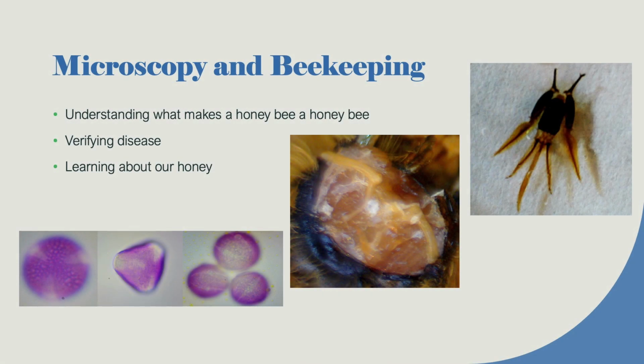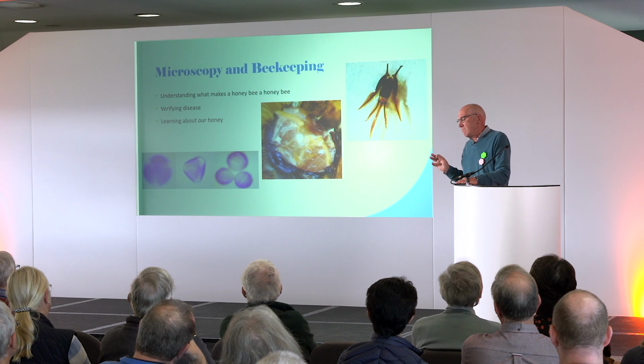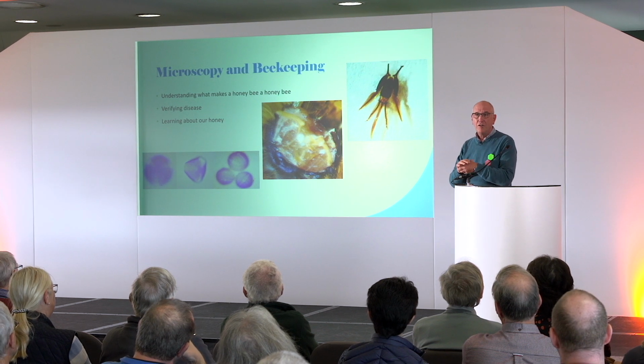A lot of people, the interest in microscopy is learning about your honey. And at first pass, you might say, well, I can just take some of my honey, stick it on a slide and look at it. But you have to understand, and you have to put a lot of work in behind so you know what you're looking at. There's no use trying to write an article on a topic which you haven't researched and when you haven't gone to a library.